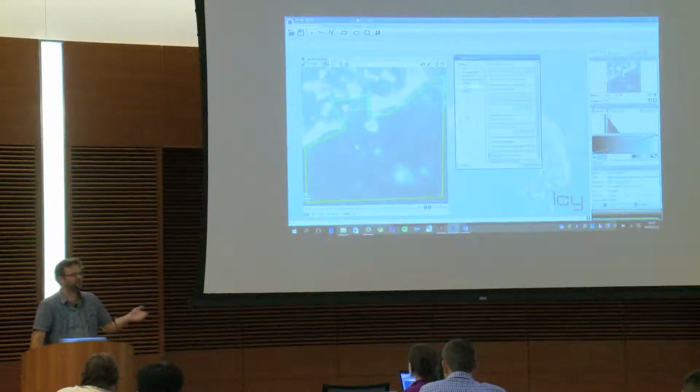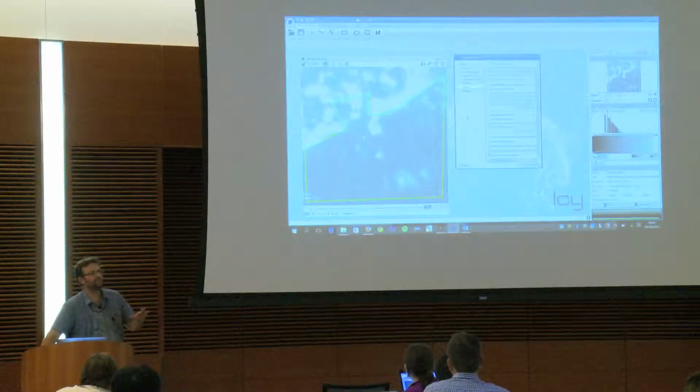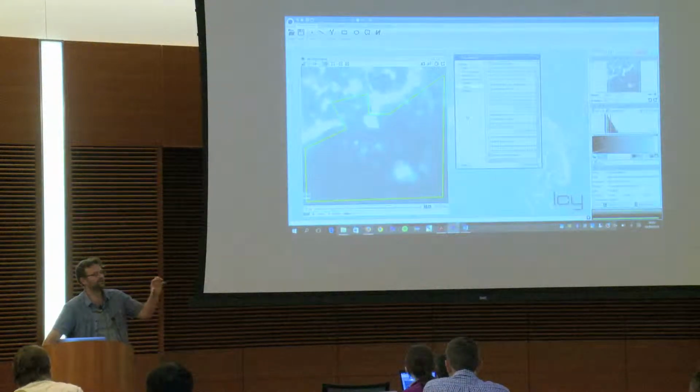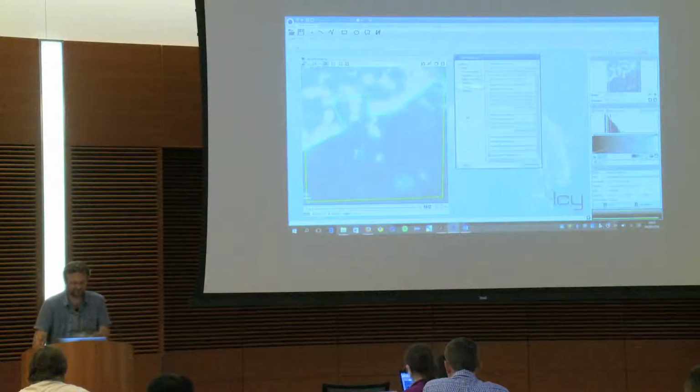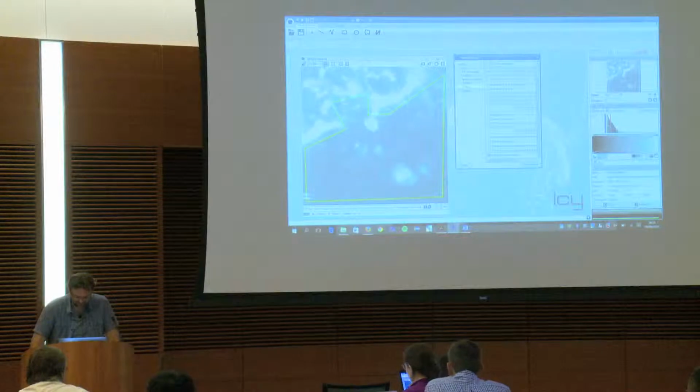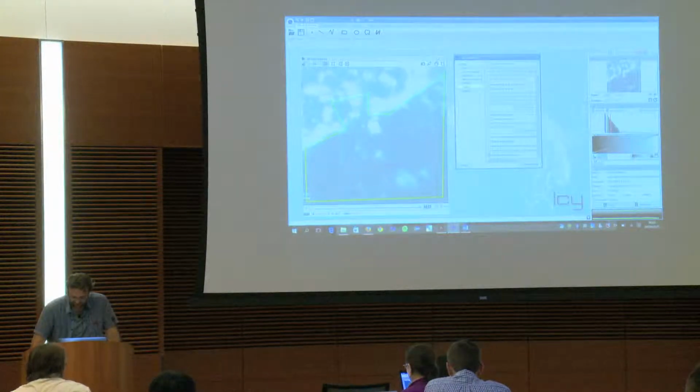And now, thanks to the protocol that you saw, it's something that we completely dropped, because when data is produced, it is directly sent to the next plugin. But it's still funny for the multi-agent things. So I run it.